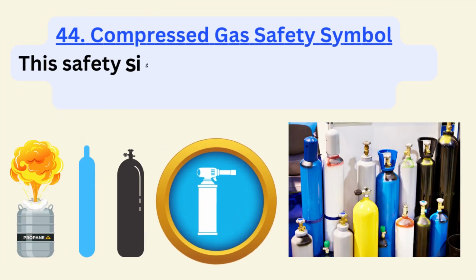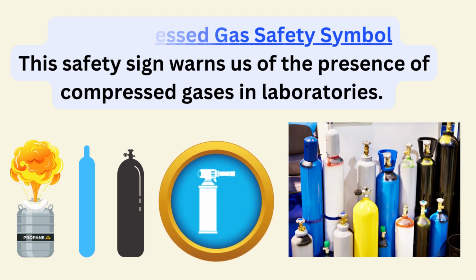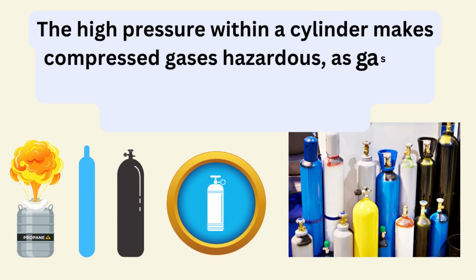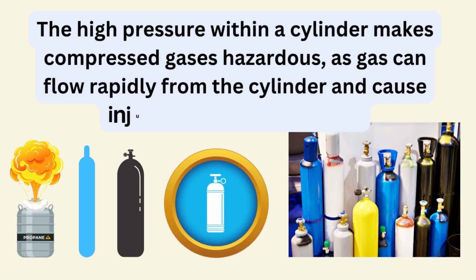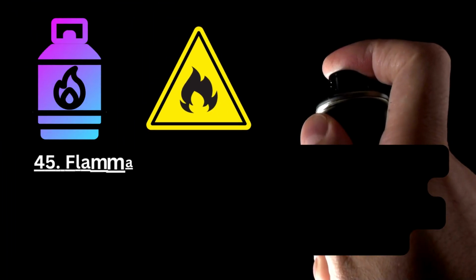44. Compressed gas safety symbol. This safety sign warns us of the presence of compressed gases in laboratories. The high pressure within a cylinder makes compressed gases hazardous, as gas can flow rapidly from the cylinder and cause injury, fires, or explosions.